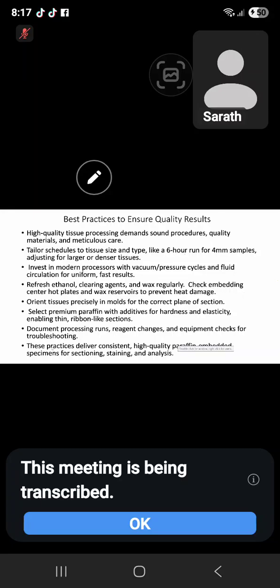These practices deliver consistent, high-quality paraffin-embedded specimens for sectioning, staining, and analysis. So if somebody asks what the steps are to be followed to have very quality laboratory functions in histopathology, you have to mention these points.